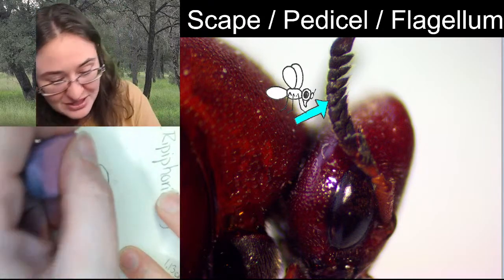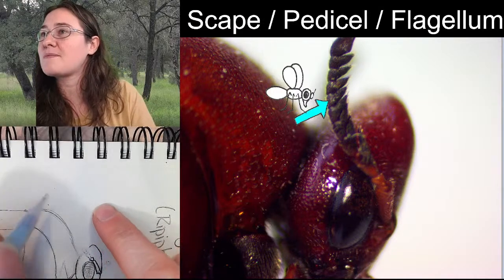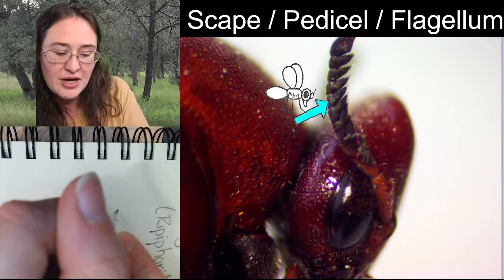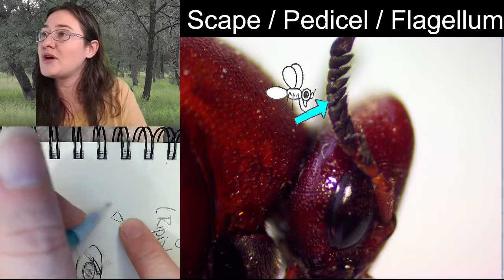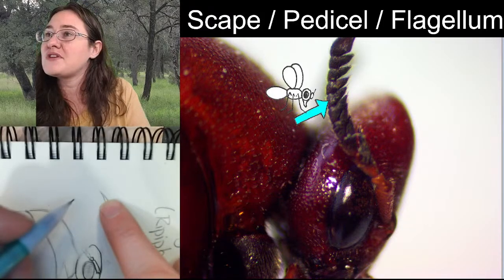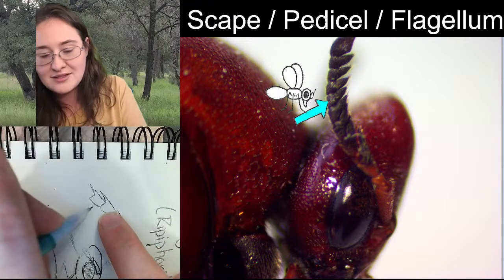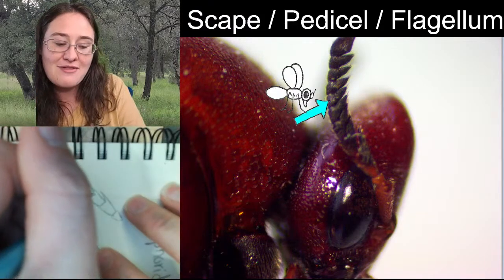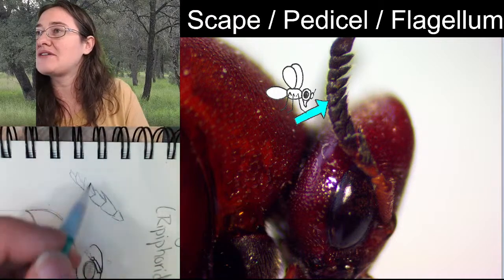And I'm going to resketch these first two because after checking them out under the microscope, they're this really cool shape. I'm going to draw it really big here so that you can see. So the pedicel is that really small triangular shape, so I'm just going to draw this little triangle here. But that first segment of the flagellum, where it almost looks like a large rectangle, it actually has kind of this spine coming up. And the next segment is the same way. It looks like a large box, but there is this spine that's coming up along the top. And then the rest of them all have spines like this, all going down.